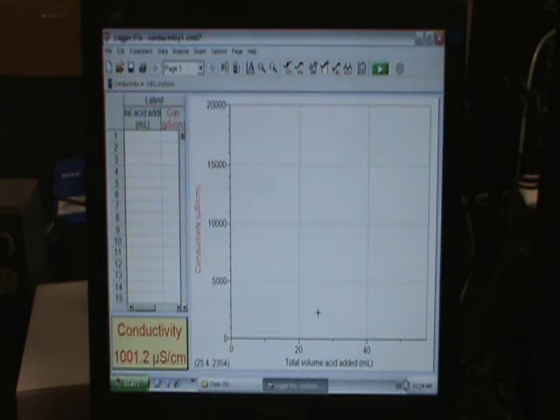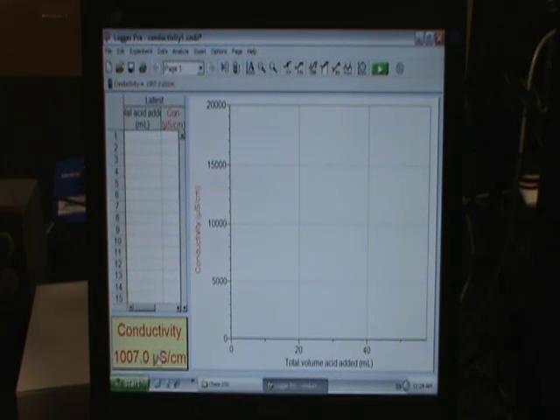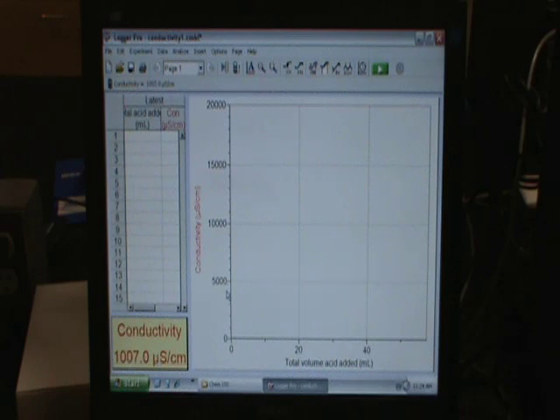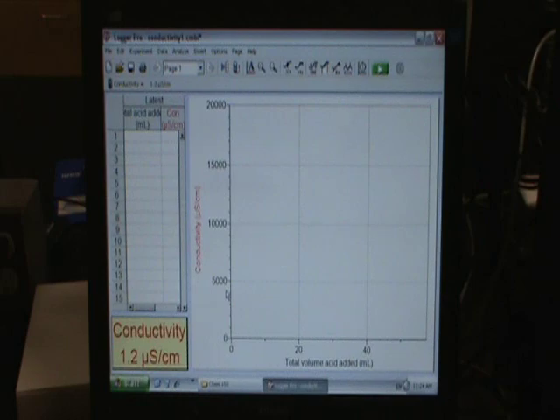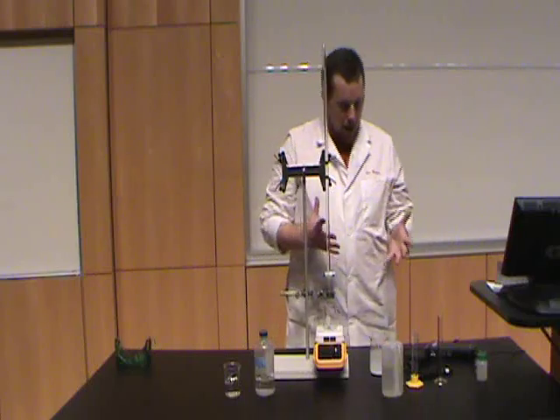Now our sensor is calibrated — click Done. I'm still in the calibration standard here, so it's at about 1,000 microsiemens per centimeter. As soon as I take it out, now I've got it in air, so it's dropping down to essentially no conductivity at all. Our probe is ready now.